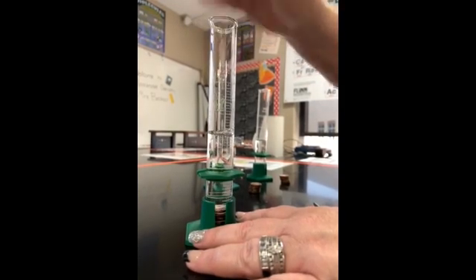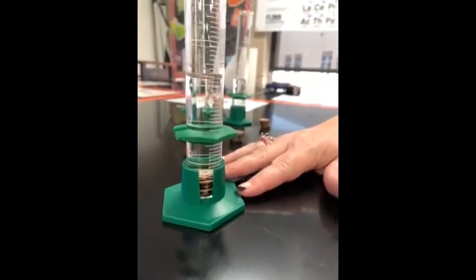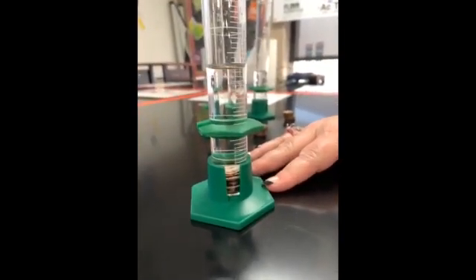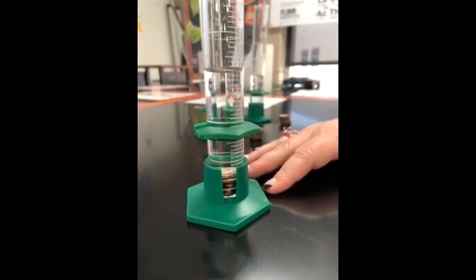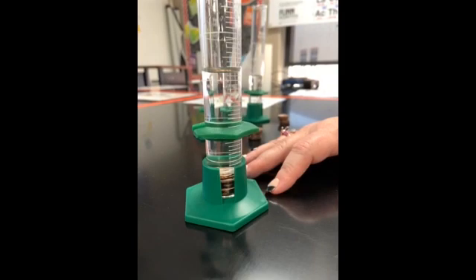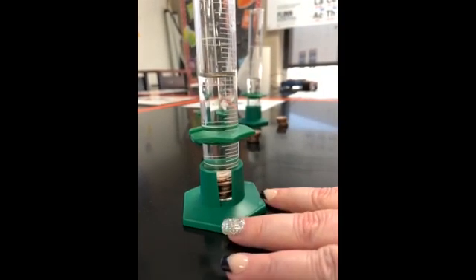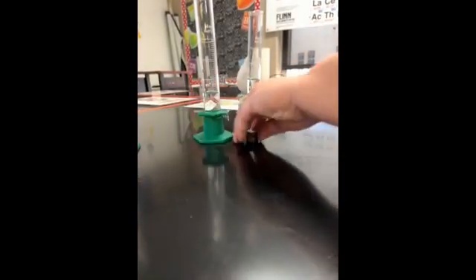Let me get my extra digit there. So we're on trial 2, post 82 pennies. We have added the pennies, and the volume looks like 32.10. 32.10. Again, these cylinders are a little bit different than the previous cylinders.